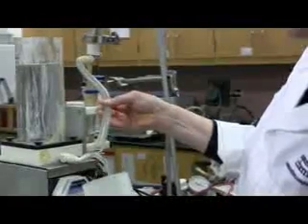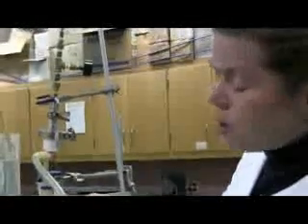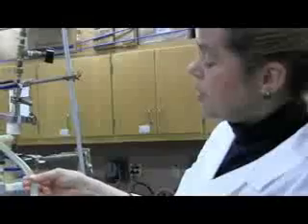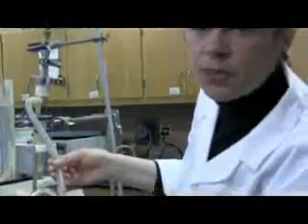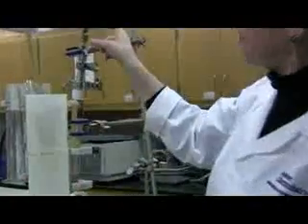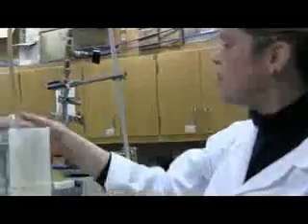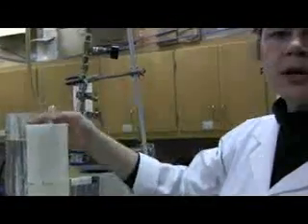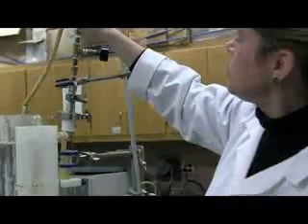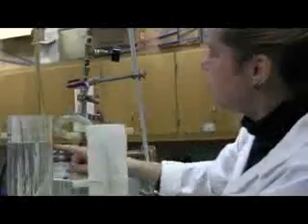So part of the lab is to measure the flux. Flux is the flow of the permeate, okay? And we're going to measure that as a function of pressure. So that pressure is clearly the pressure drop across this membrane. How do we know that's a pressure drop? Because what's coming out here is atmospheric. Okay? All right, so this is going to be the retentate, and right now I'm returning the retentate flow to the tank.